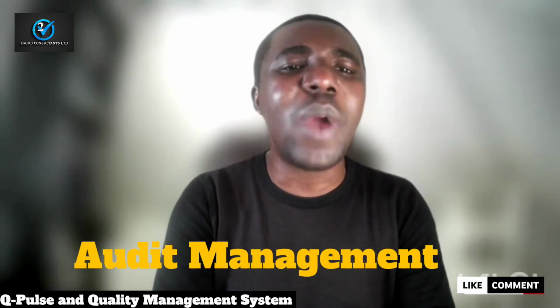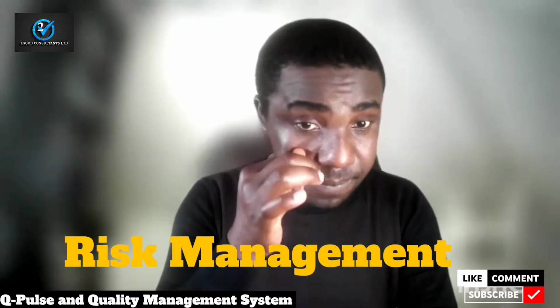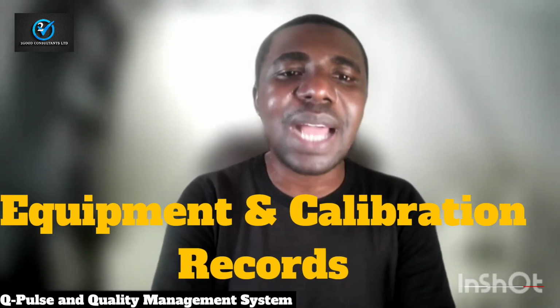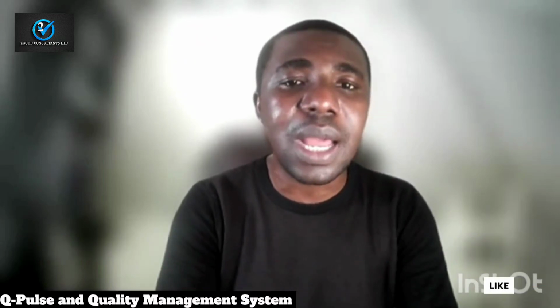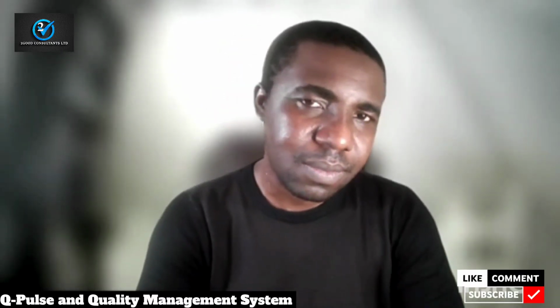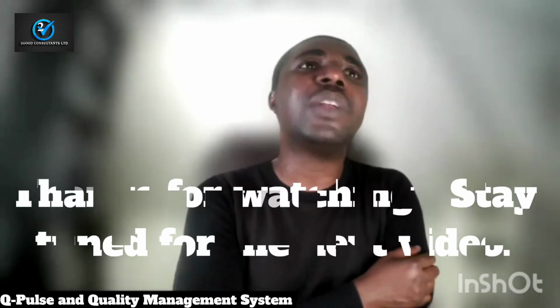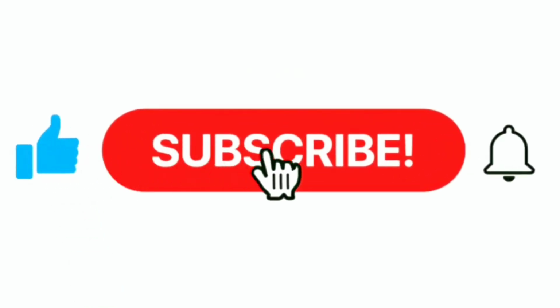Number 4 is to determine where there is non-conformance or incident reporting. Number 5 is to ensure risk assessment, like risk management. Number 6, to ensure there's equipment and calibration record. And number 7, to ensure there's continuous improvement. You see, these headings we are looking at capture everything about the 12 essential quality management system. That's why when we understand this, we now know which aspect. Remember when I mentioned the 12 essentials, I mentioned document control, something like that. Are you getting me? Now, we need to ask ourselves, what then is document control?